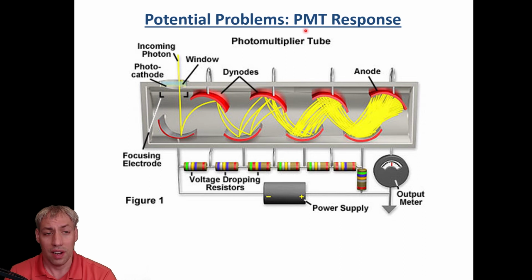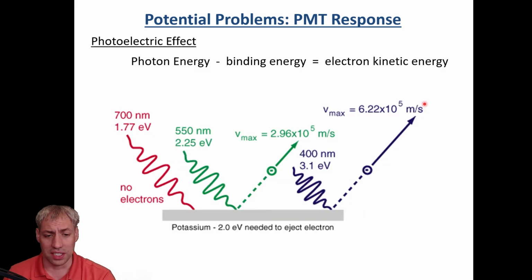And that's why it's called a photomultiplier tube. So really cool technology development in terms of detectors. This is why you can start detecting single photons, because you're not just getting one electron out of it, you're getting thousands of electrons out of it.